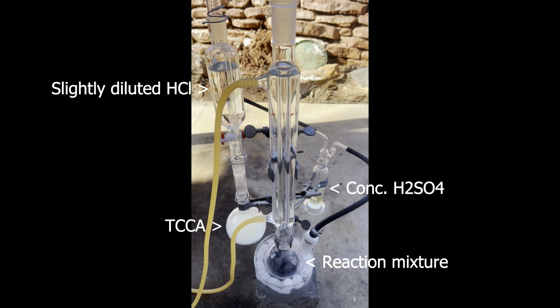I dry it because the ferric chloride and/or sulfur chlorides that I'm pretty sure are forming upon reaction with the chlorine, even when it's in an ice bath, are water sensitive, and any water will affect the catalytic effect they have. The ice bath is there because the reaction is exothermic and the temperature affects the ortho and para ratios of any dichlorinated product.